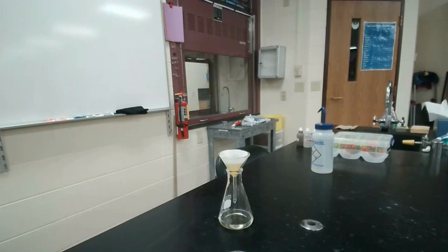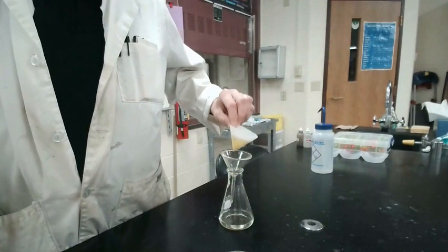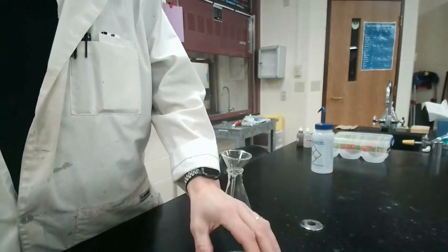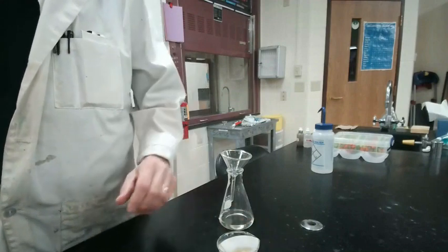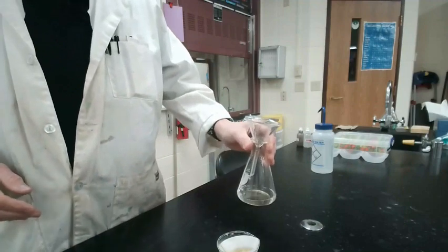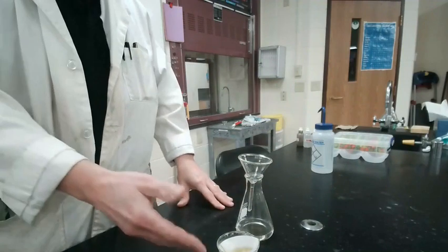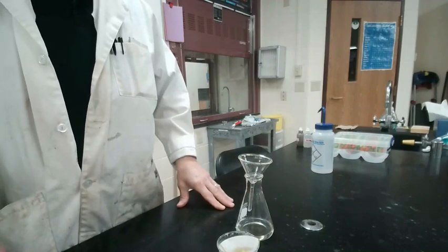All right. So here we go, ladies and gentlemen. All of the liquid has gone through the filter paper. I take it out. I'm going to put it into the container with my precipitate that's sitting in the bottom. I will rinse this out in the sink. This will be ready to use for another class. I'm going to take this. I'm going to put this in a drying oven overnight.